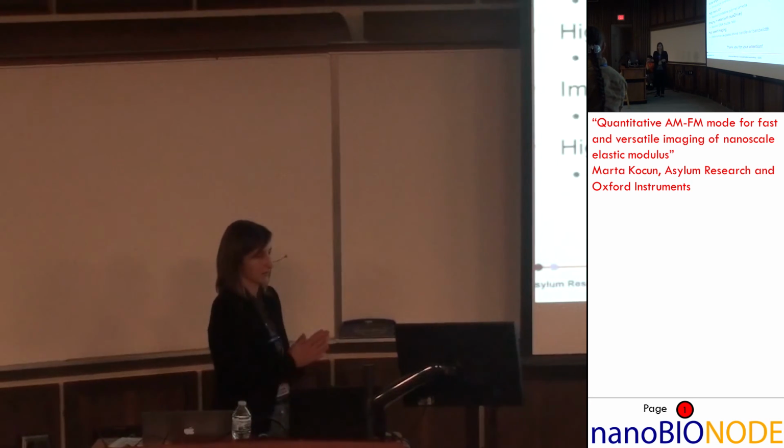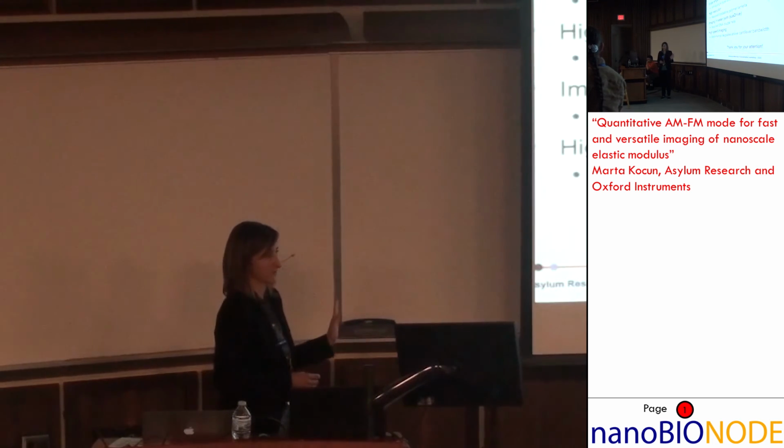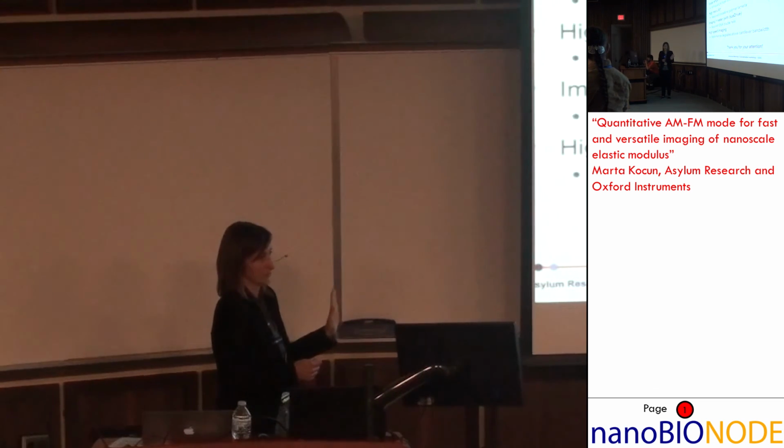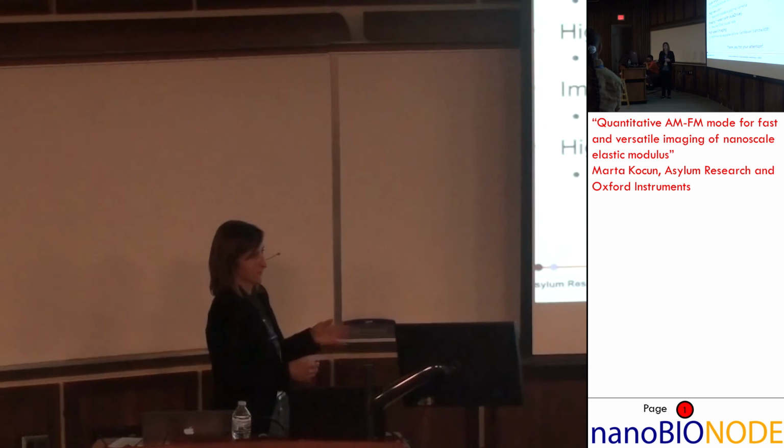What's important in AM-FM measurements is that you start with a frequency, you do your tune, you start at a certain frequency, and then you image your sample. What you use to do the calculations is actually the shift in frequency. So if you can precisely say what your initial frequency was and then see how it changed during the measurement, then your calculated modulus value will be more precise or more exact.